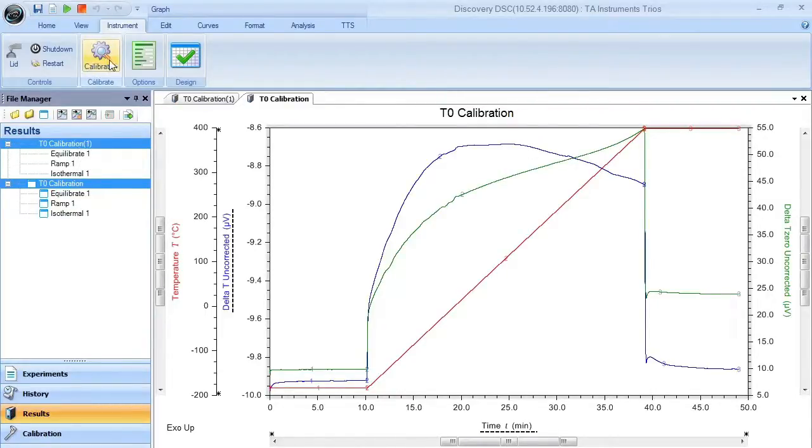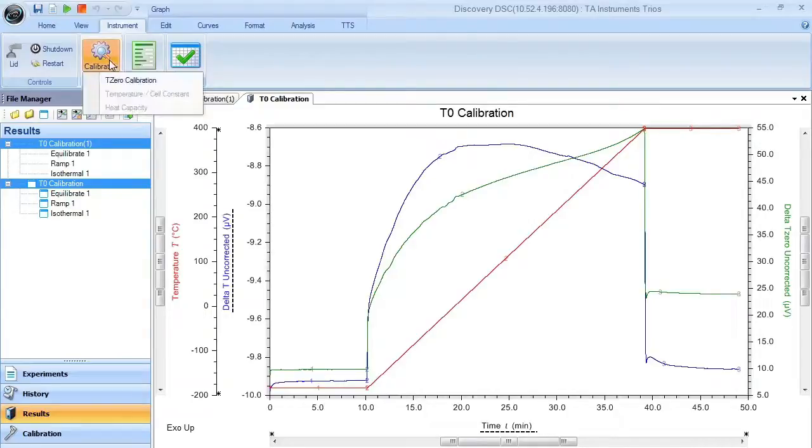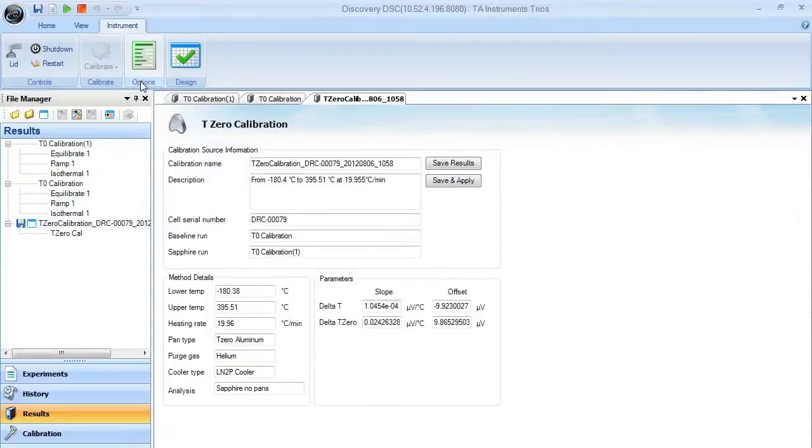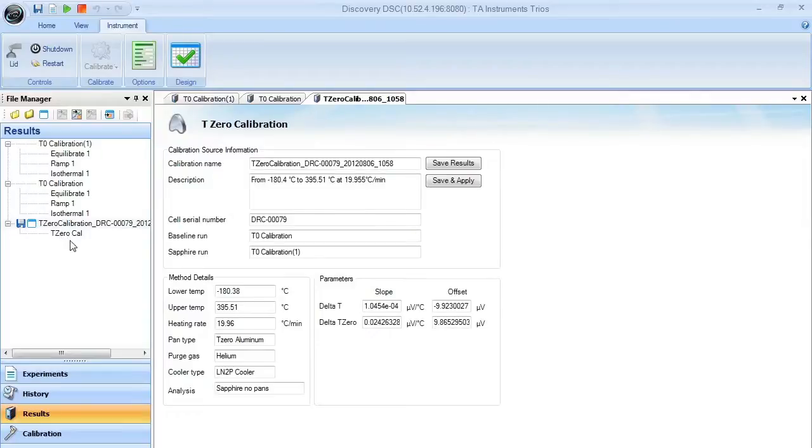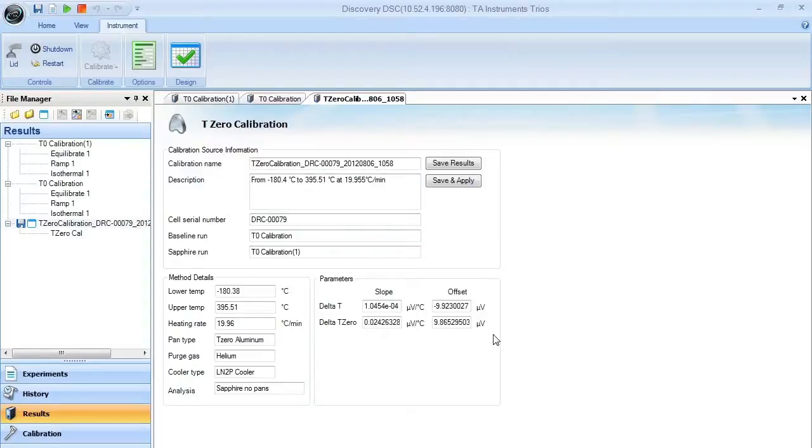you simply need to select both data sets using the control button and clicking on them with the mouse. Once you do that, your calibrate button will become active, and T0 calibration will be the active item. Once you select T0 calibration, you will get a second, third data set that shows up here, which includes all the information that is saved from those calibration results.